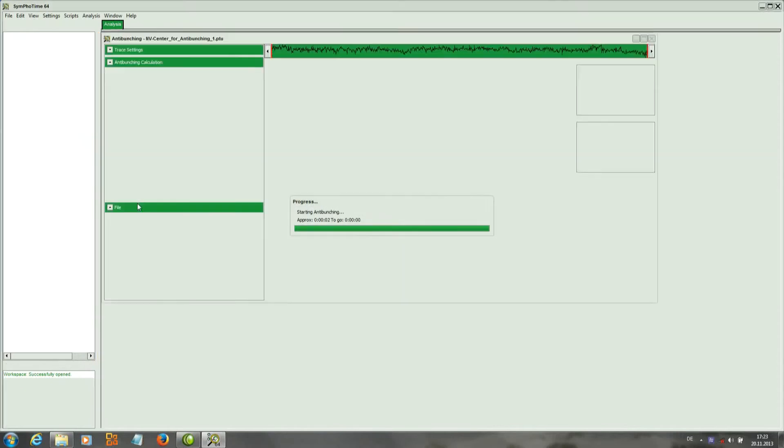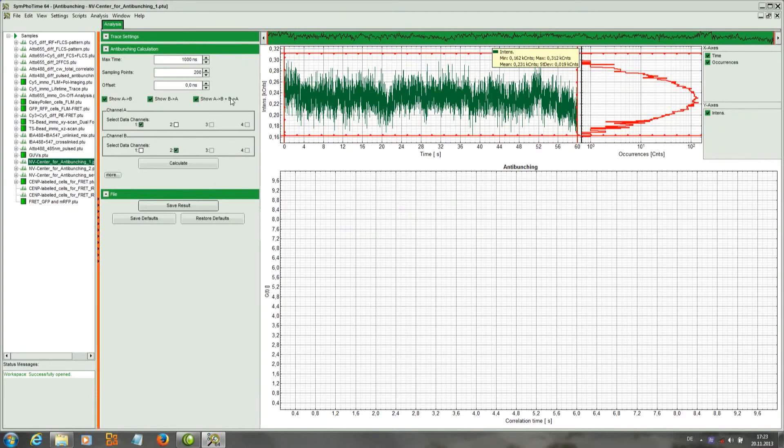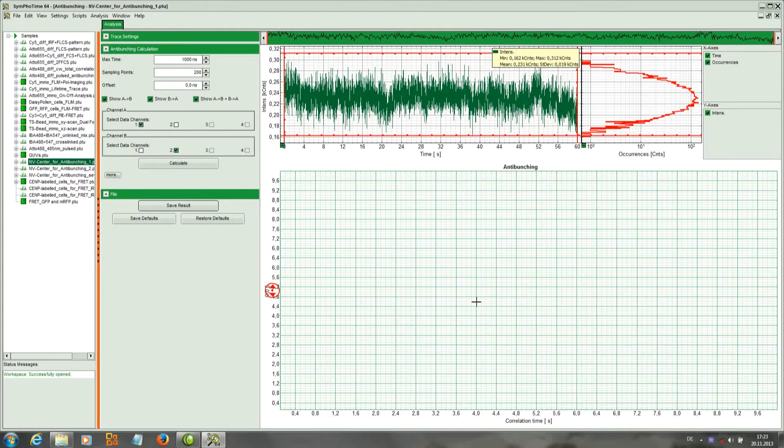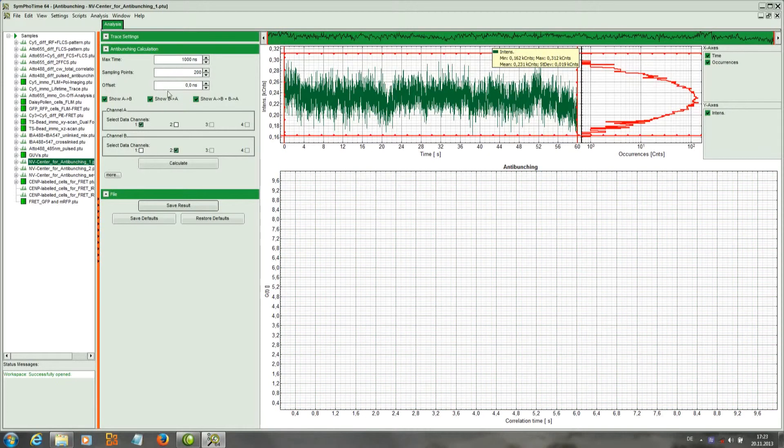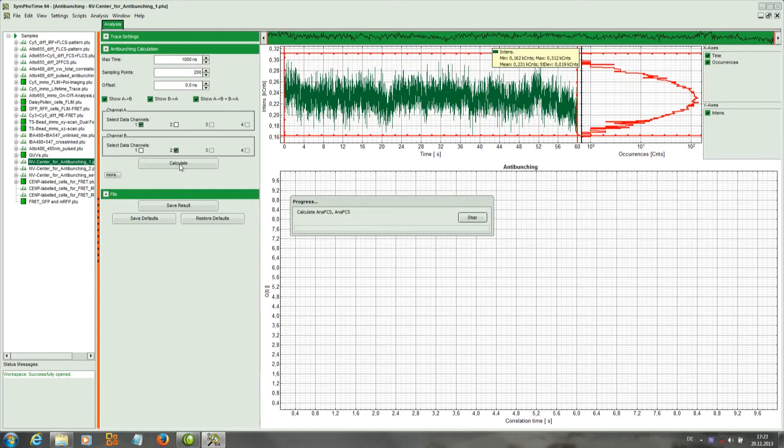So this trace is now loaded and we have a new window that appears. Here we have the parameter panel, here the time trace, and here is where the anti-bunching curve will appear. Using the standard settings we can simply correlate sector one and two and thereby calculate the anti-bunching curve.